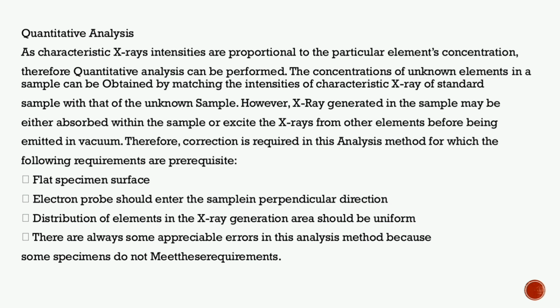A flat specimen surface. The electron probe should enter the sample in a perpendicular direction. The distribution of the elements in the X-ray generation area should be uniform. There are always some appreciable errors in this analysis method because some specimens do not meet these requirements.